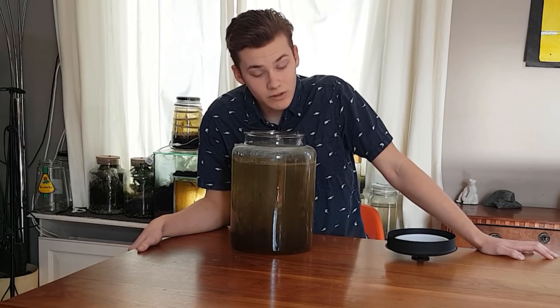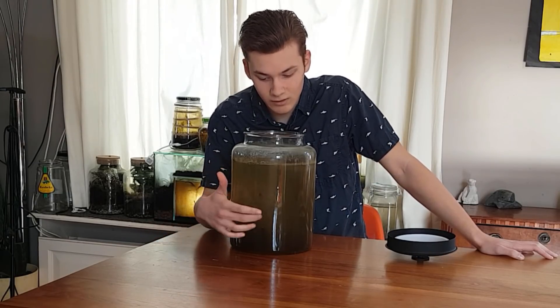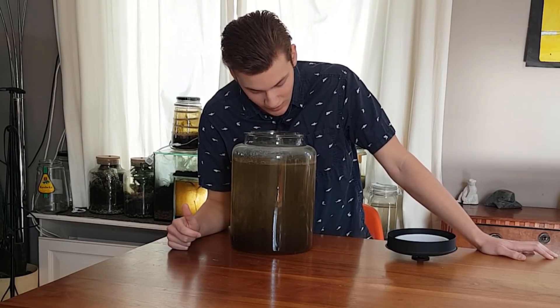And the water is crystal clear, so that's something. It's only the glass that is covered in algae. I can see everything.